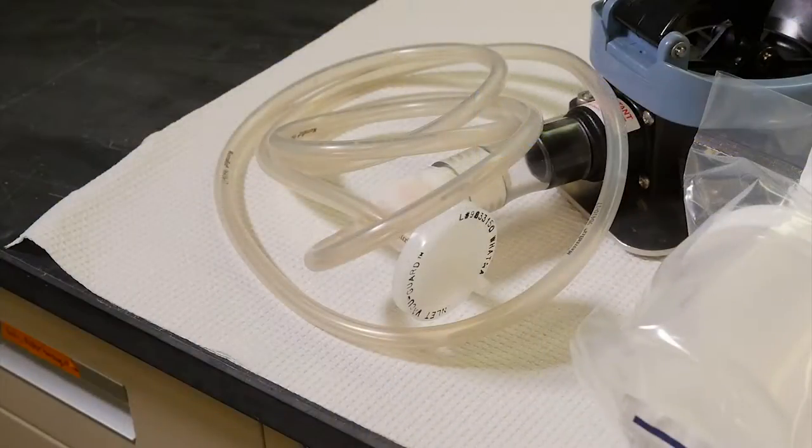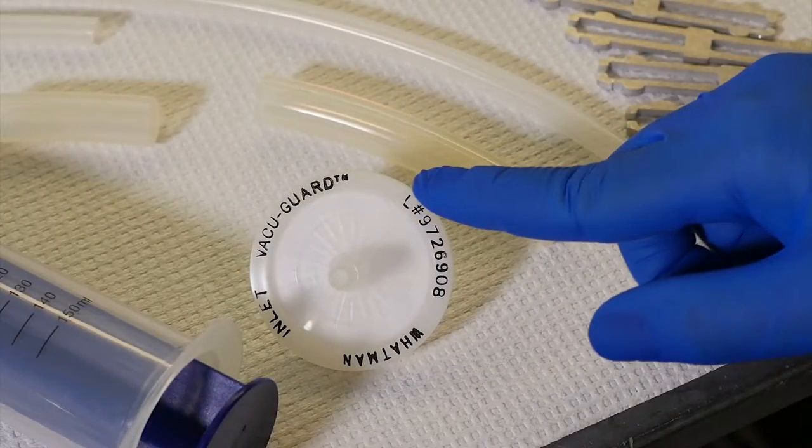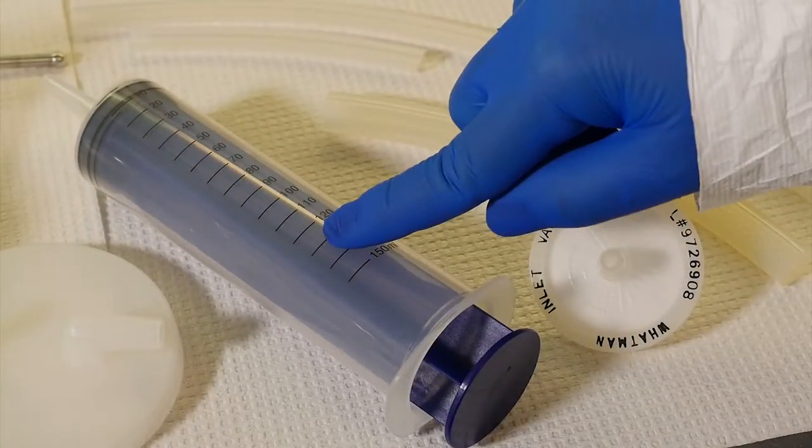Additional components include very long small diameter tubing for connecting the collection cup to the bilge pump, two vacuum guard filters to prevent cross contamination, and a syringe for eluent injection.